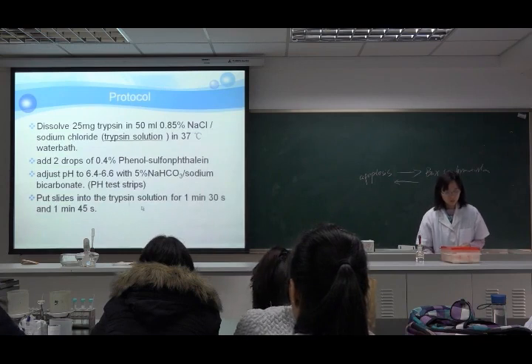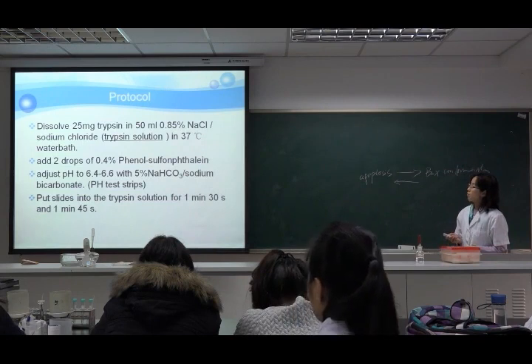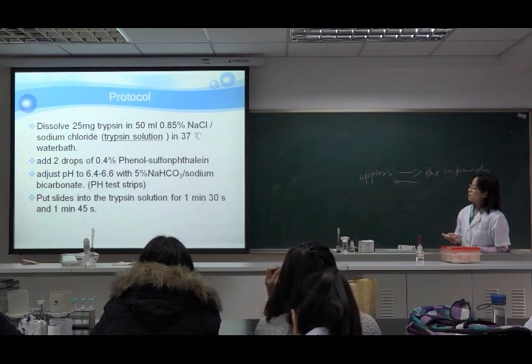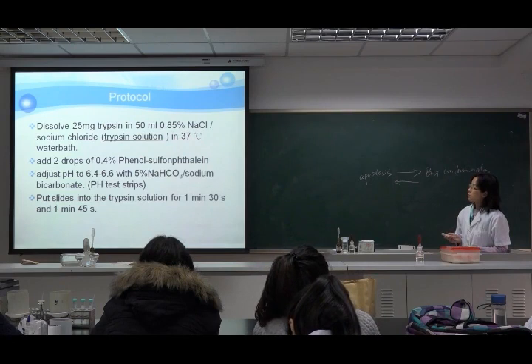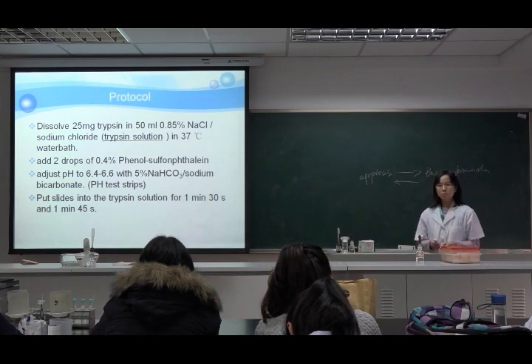This is the protocol. First, we dissolve 25 milligrams of trypsin in 50 milliliters of 0.85% sodium chloride. Then this is our trypsin solution.